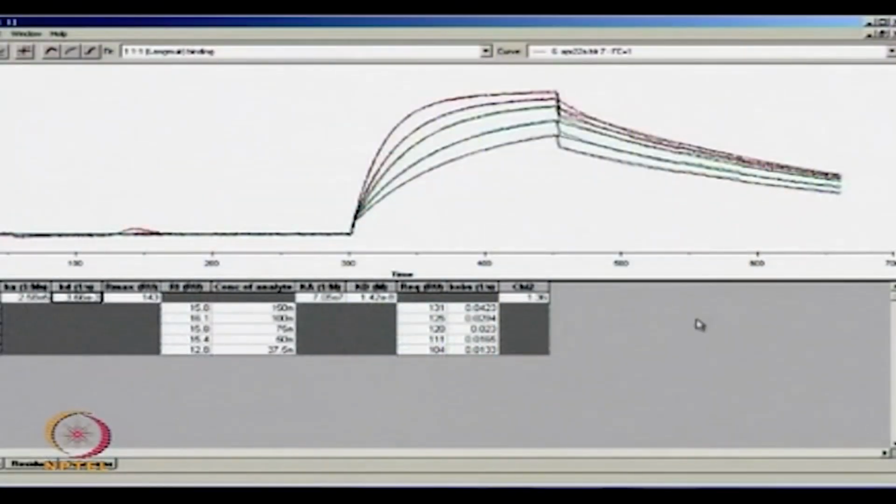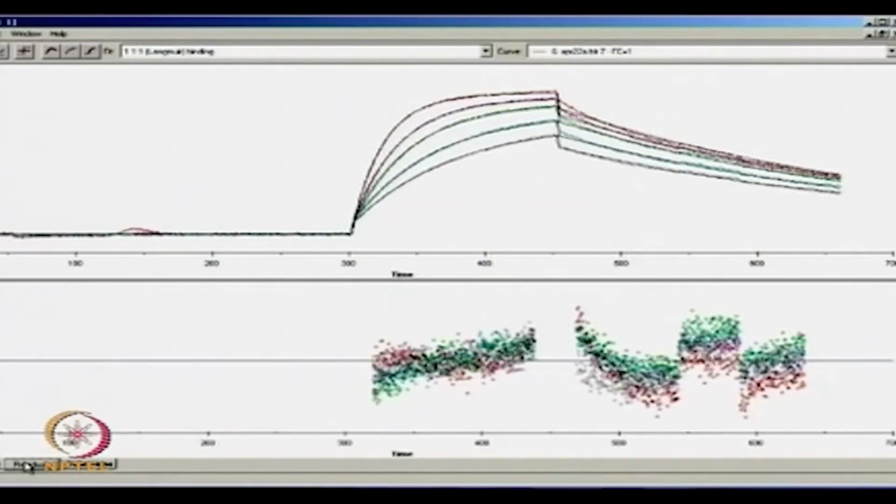And you can also quickly check how good your results are by checking the residuals, and you can see the residuals here. The chi-square values are really between -5 to +5%. So extremely good, very tight fitting reactions and a very fast analysis that gives you K on and K off. I think it's extremely fast and very good, very easy to use software for analyzing interactions. So yeah, it was very useful and informative to see the analysis, like how easy it is to perform the kinetic analysis.